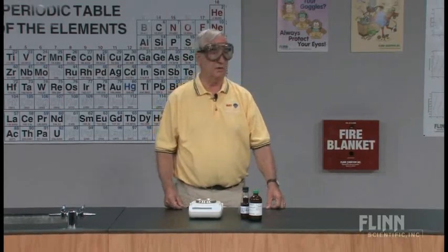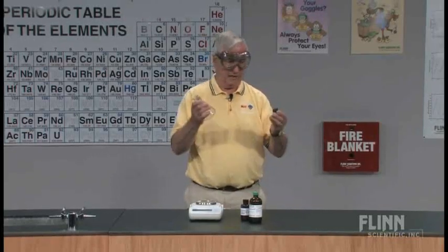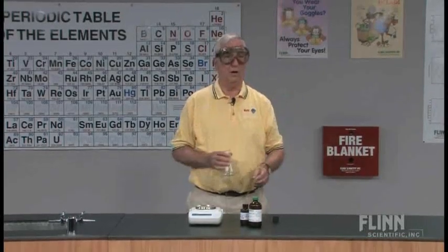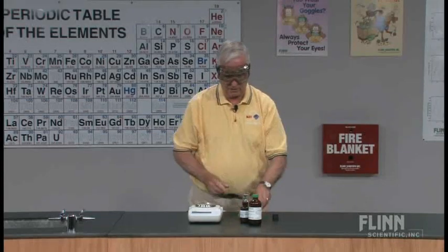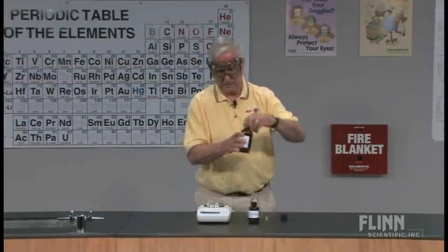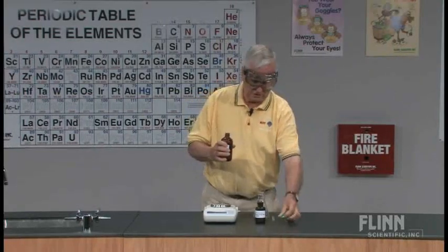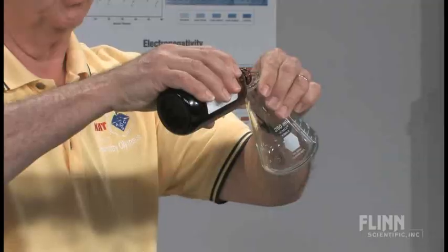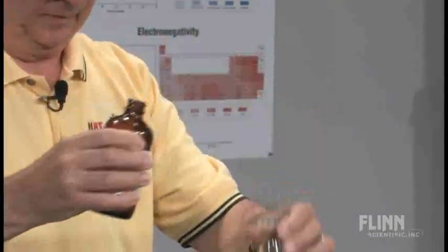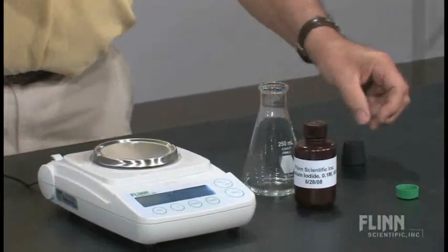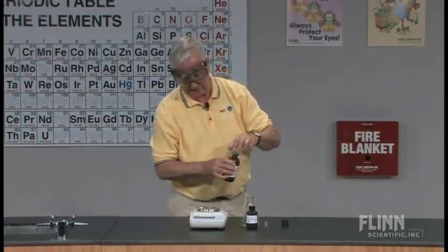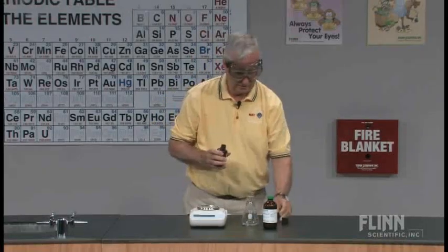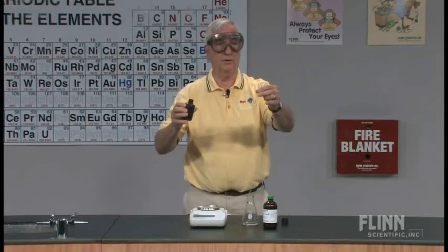In this particular demonstration, we use very simple basic materials: a flask with a small test tube that will fit down inside the flask. The chemical changes we're going to observe involve two reagents. The first is silver nitrate, and what I'm going to do is pour a small amount of silver nitrate down the side of the flask. The second reagent is potassium iodide, and we are going to put that into a second container — a small 13 millimeter culture tube.